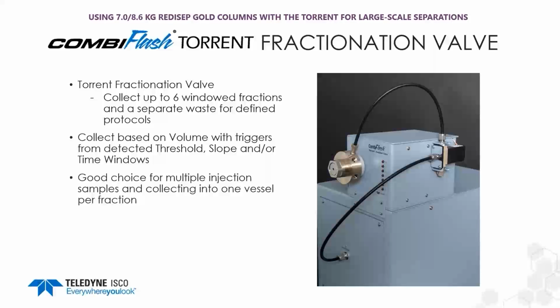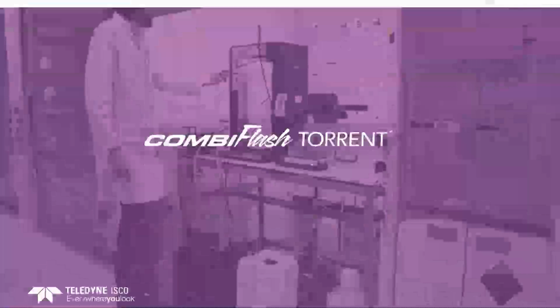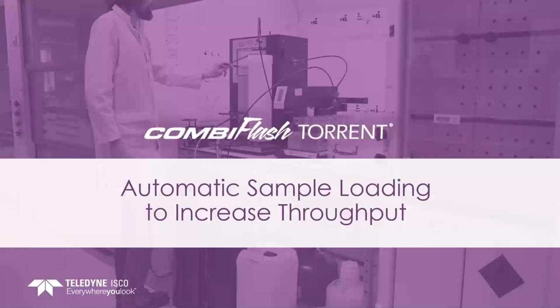This is a really good choice for multiple injection samples, and we can collect into the same container. You can essentially do fraction pooling this way, and it allows you to do fraction pooling into the same container over multiple runs.